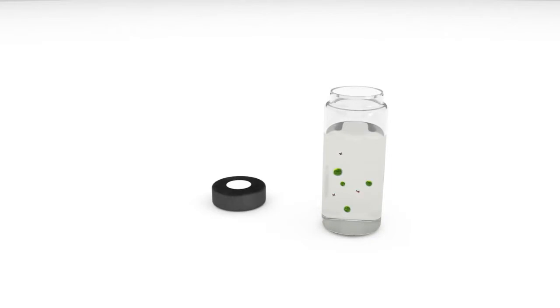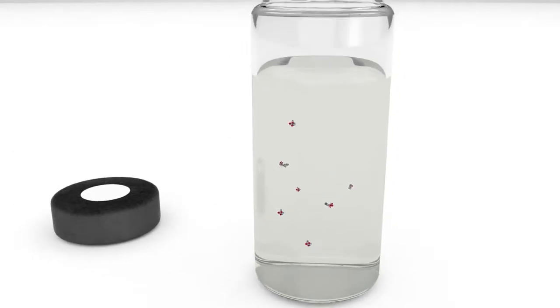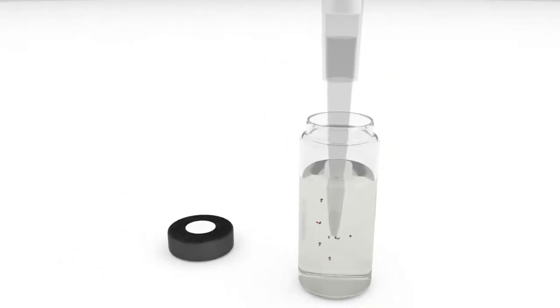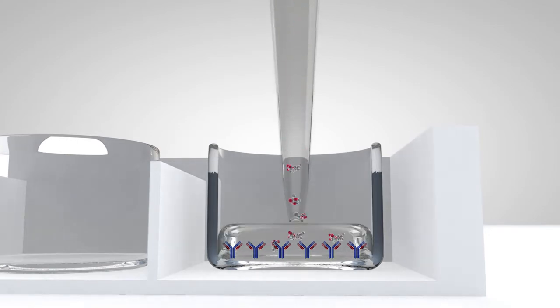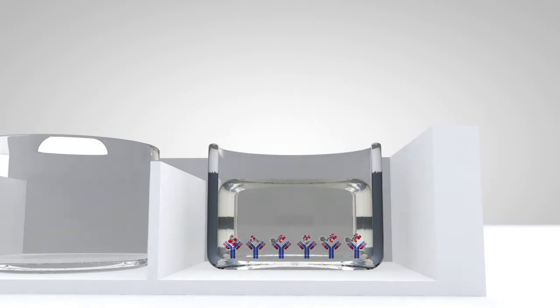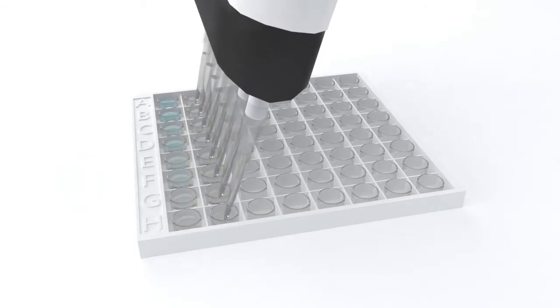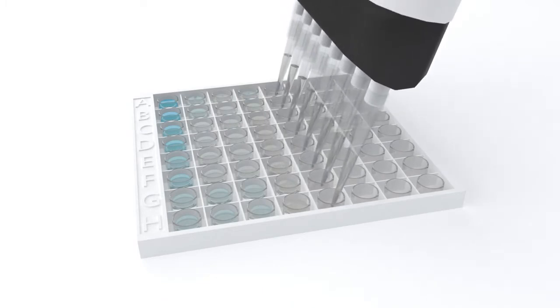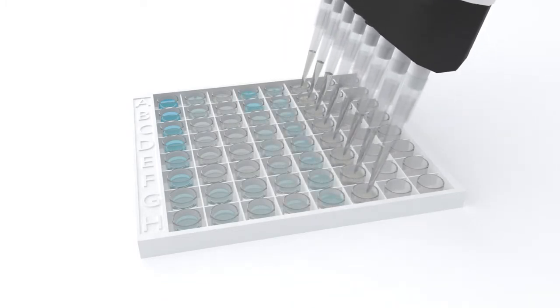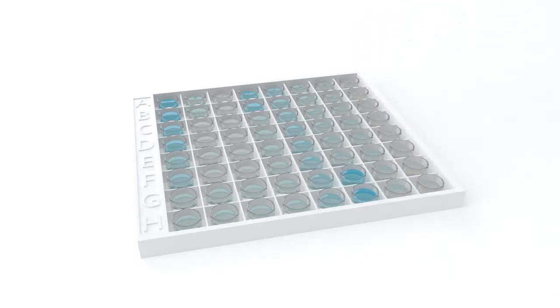The assay involves collecting a water sample, rupturing or lysing any cyanobacteria cells, and detecting the specific toxins using the sensitive antibody-based ELISA technique. ELISA produces different color intensities depending on the toxin concentration. Please refer to the Ohio EPA method to learn how to collect, preserve, and prepare samples for ELISA analysis. These important steps are not included in this training.